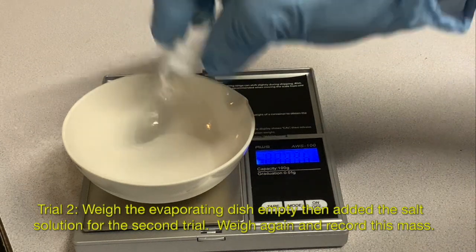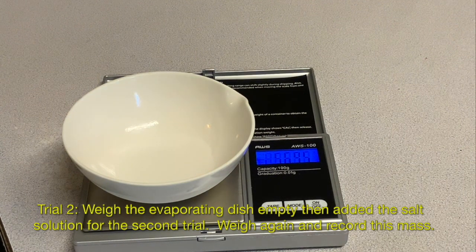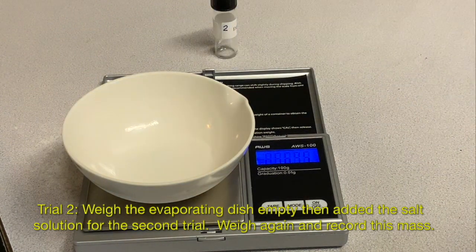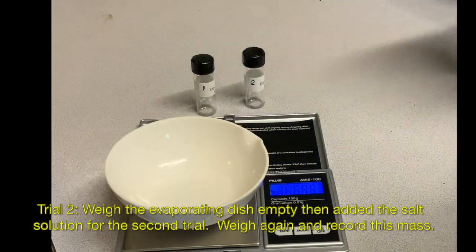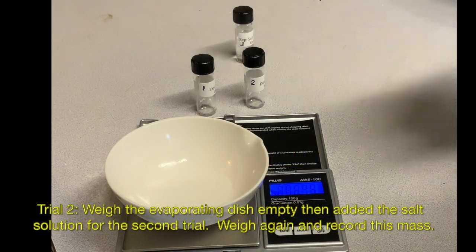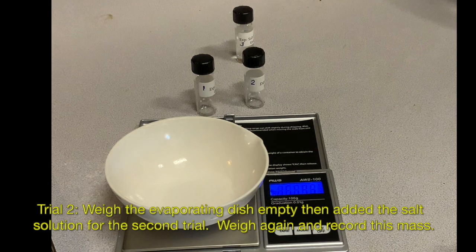And that'll be the mass of the solution. So this mass comes out to 56.95.